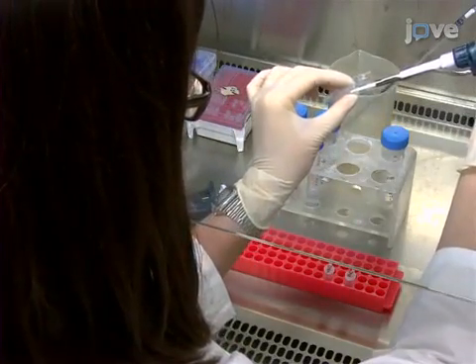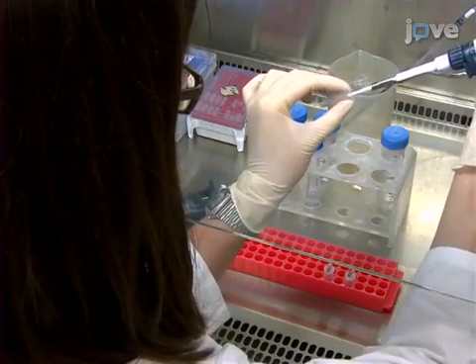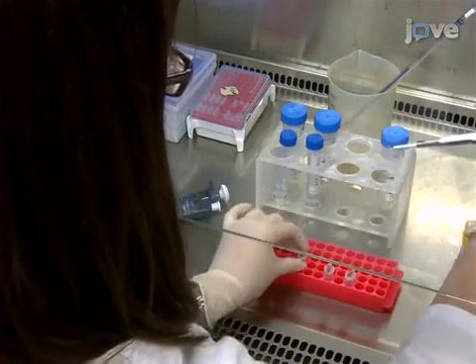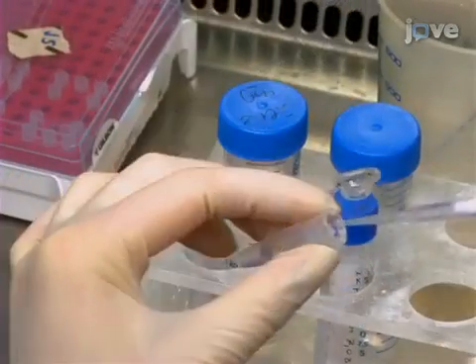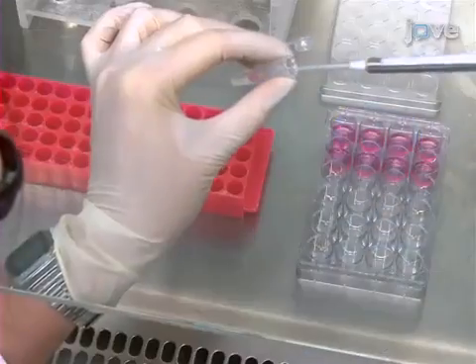Begin this procedure by collecting the conditioned media and subjecting the neurons to starvation in DMEM, then mix DNA solution and calcium chloride. Add 2x HBSS and gently mix the solution by making air bubbles. Then, add 40 microliters of DNA precipitate.